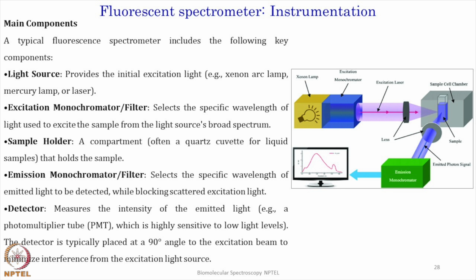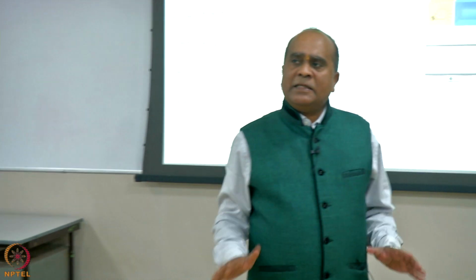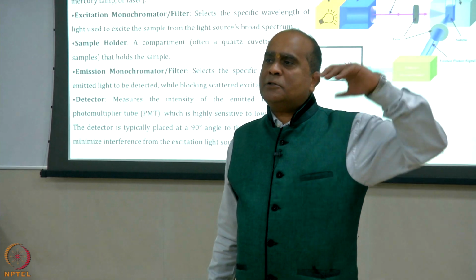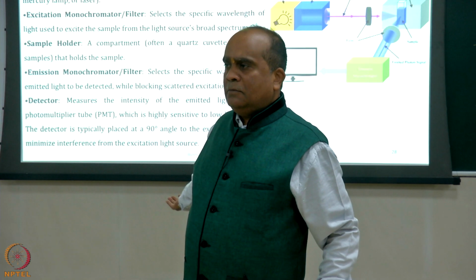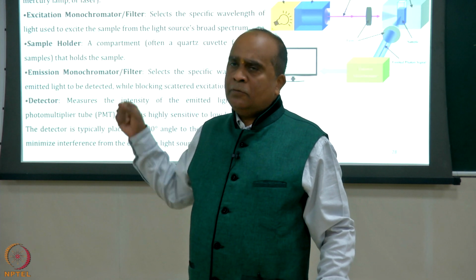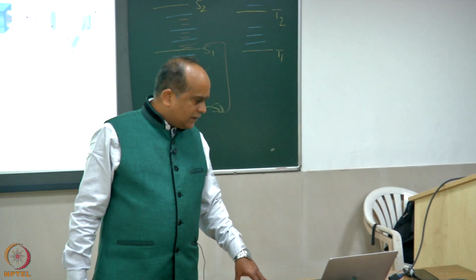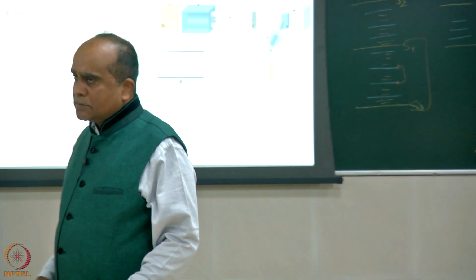For MSc level this is enough, but when you want to go more and more, into microscopy, the concept remains the same, you require a light source, but if you want to do a fancy experiment, this light source changes to a laser source. For the photodetector you require a single photon counting instrument, because you want to measure even the feeble photons that are coming out from the cell. So, it depends upon how deep you want to go, you require a different kind of setup, right. So, that is a simple experiment.